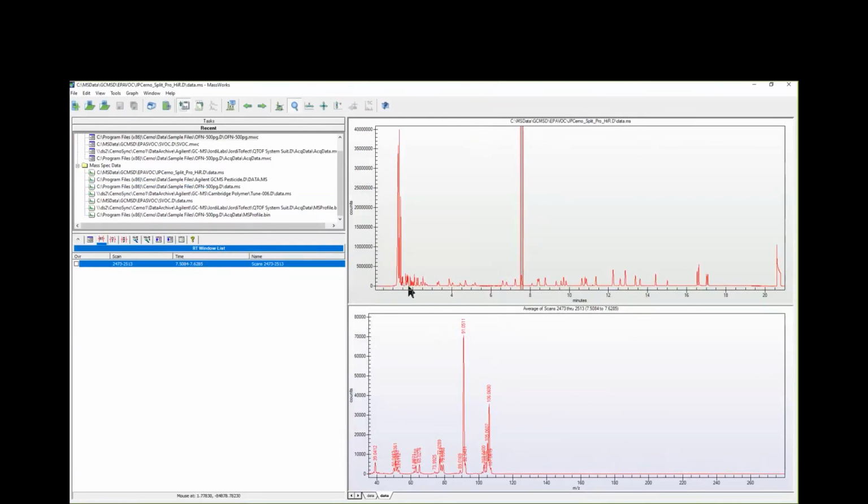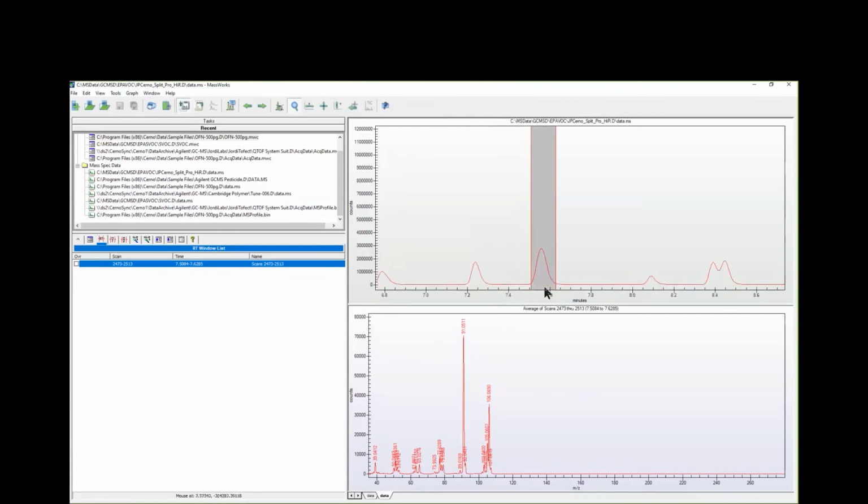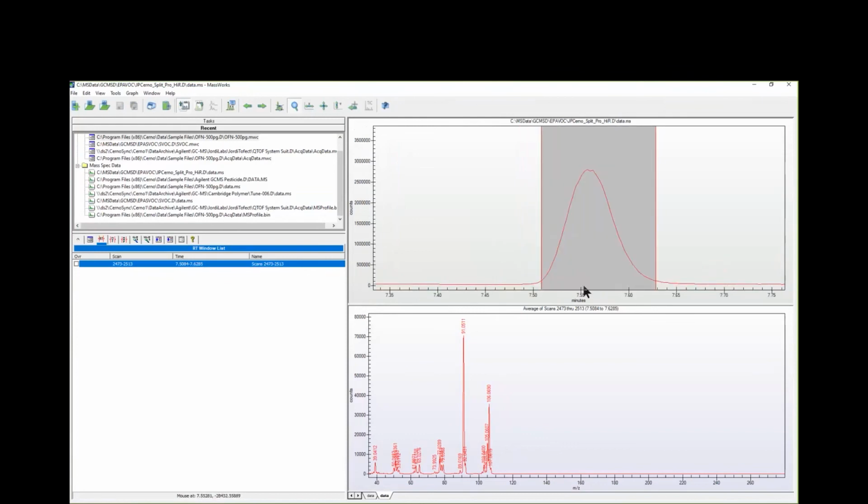This is the VOC run. Nice, pretty nice clean run. You can see at the end of the run, the calibration gas was turned on. So that's what it's using. So this is now calibrated data to accurate mass and accurate spectral accuracy. That's one of the compounds that I'm interested in looking at. Let's zoom in on this ion here.